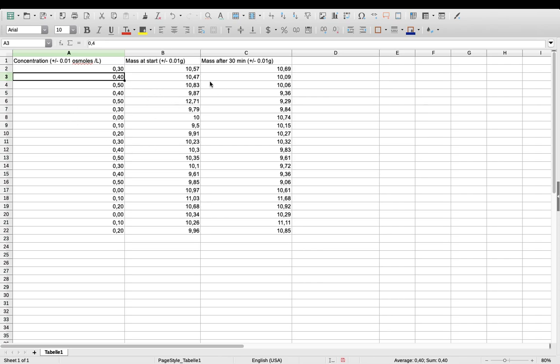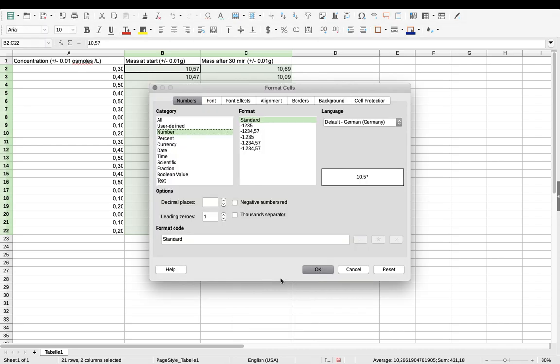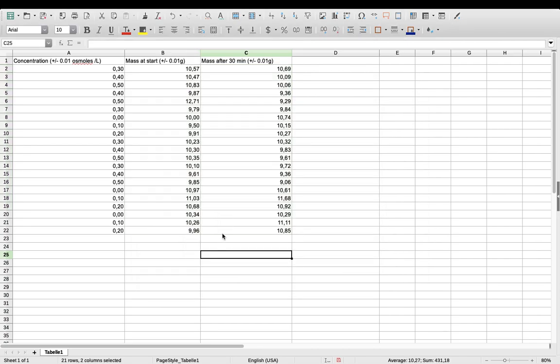And I need to go ahead and do that for the rest of these. I could have done that all at once. They all need to be showing 2 decimal places. So I'm going to go ahead and do that first and make sure that my measurement uncertainty agrees with my table. Now it doesn't change anything as far as the calculations. The 0 is assumed by the program, but when you're presenting your data tables, this shows that you know how to communicate using measurement uncertainties.